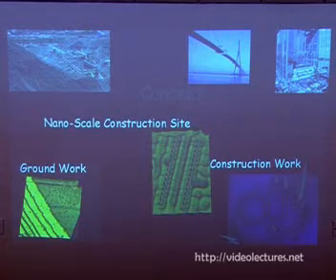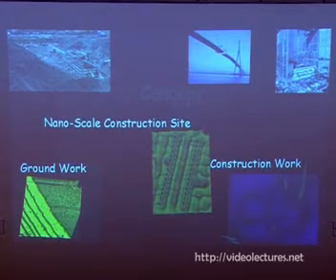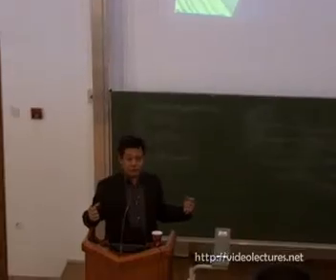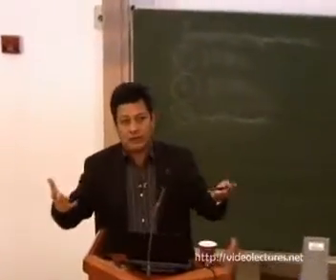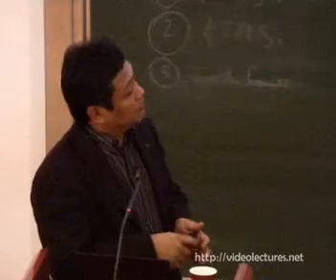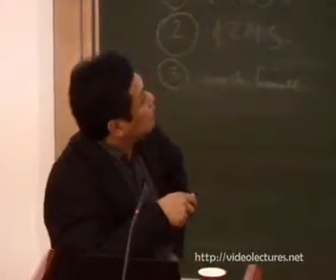Now, to do that, we have to have atomic scale control. So that is where the important physics comes in. How do we create the atoms? We can deposit atoms on the surface, but we can also take them out of the material, because we are working on a surface which is made of atoms. So the important physics comes in. There are 2 techniques to take out the atoms.